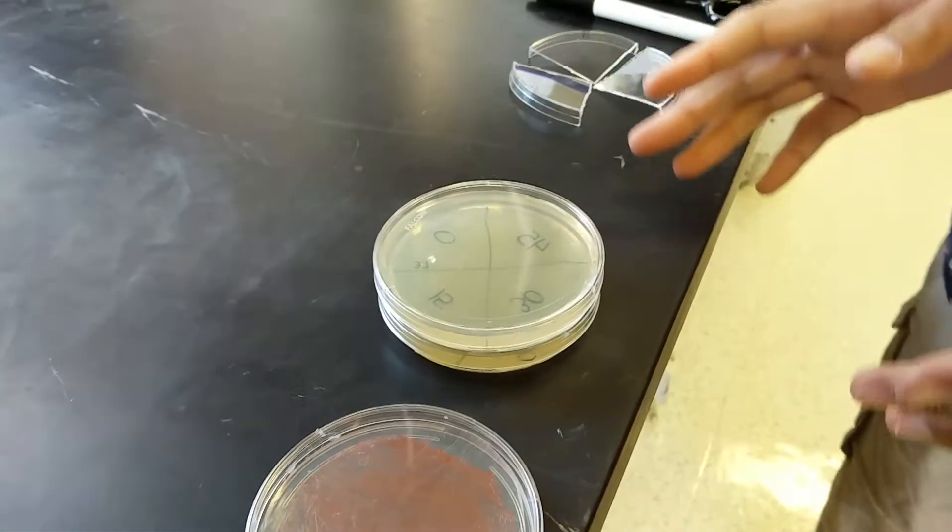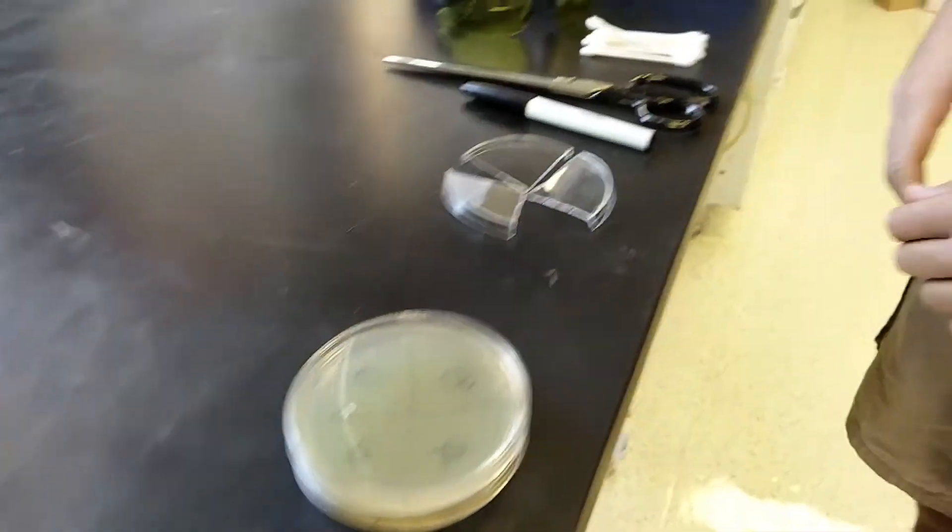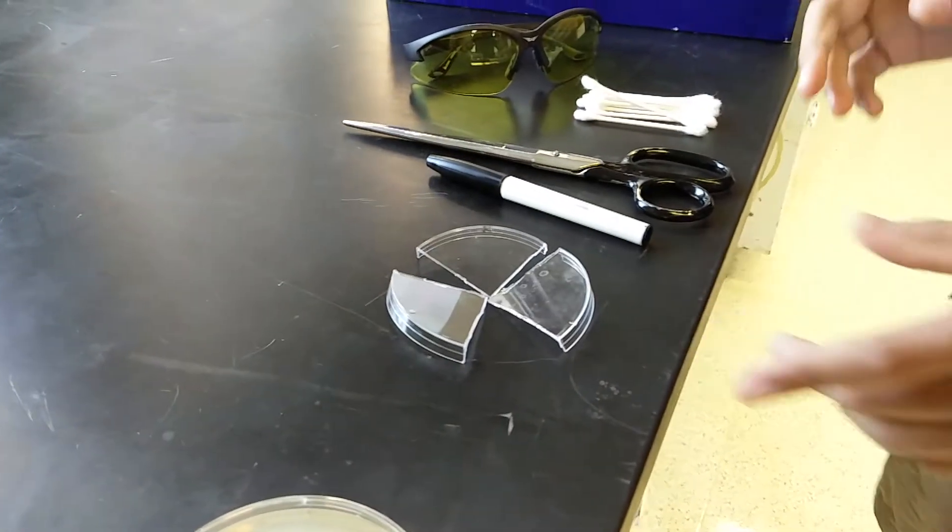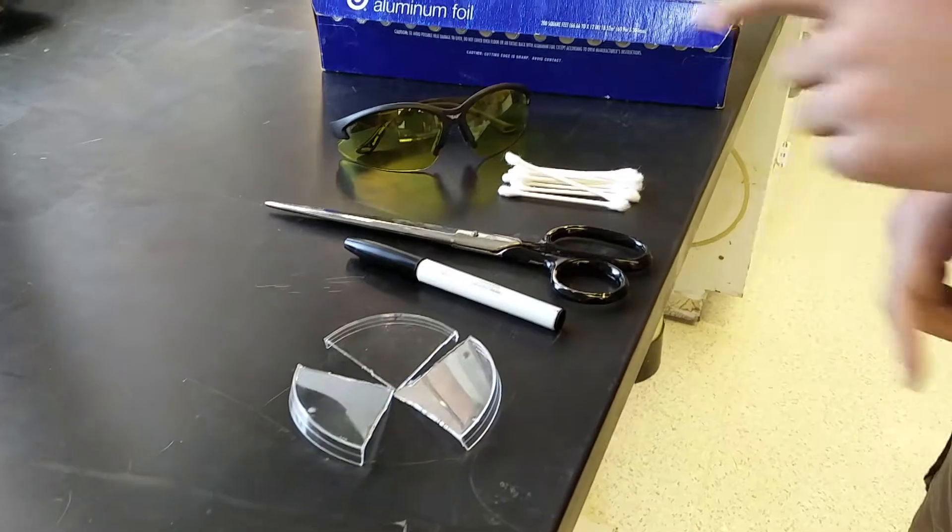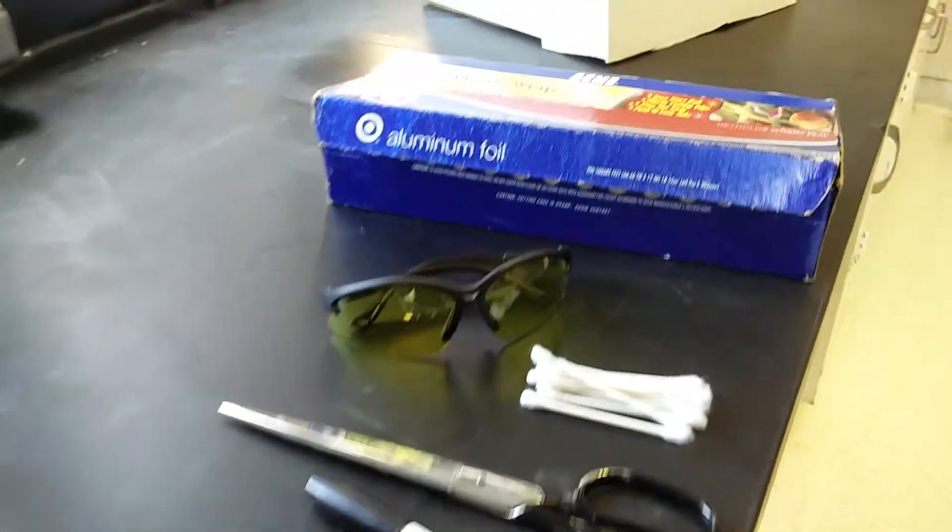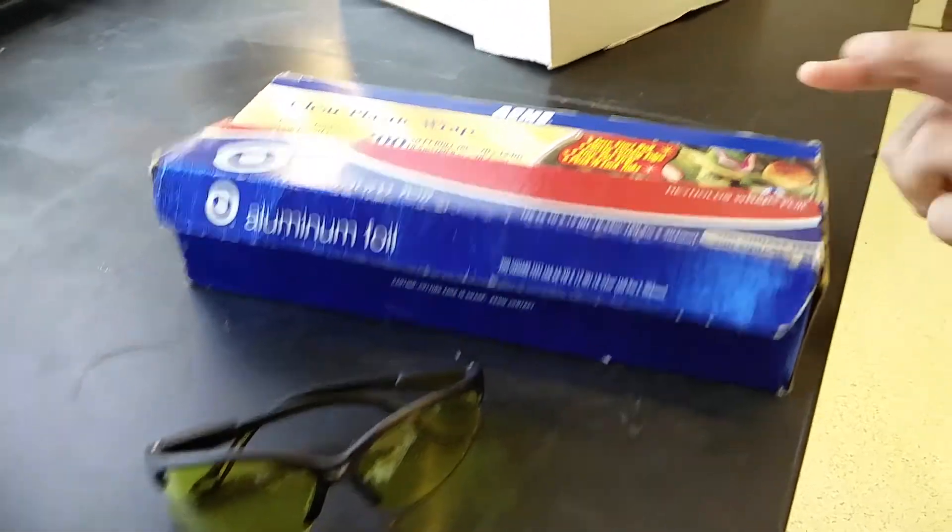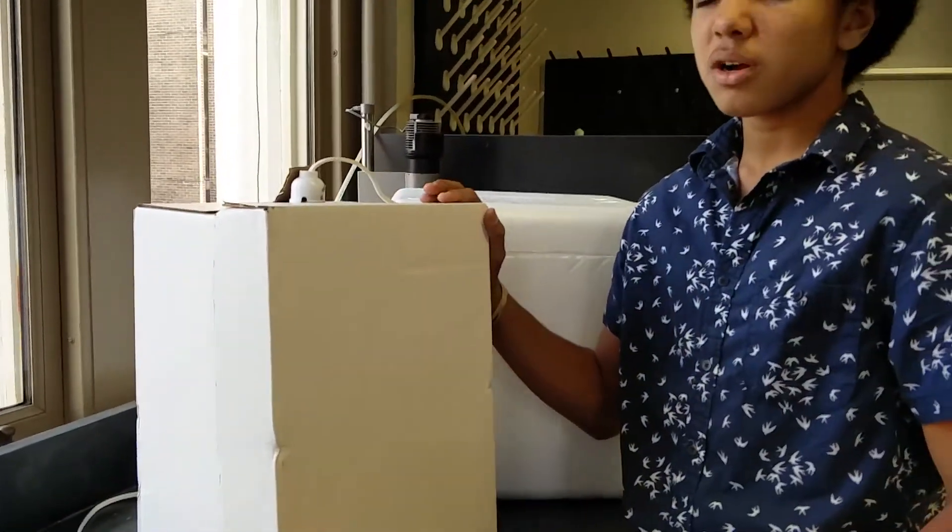Depending on the size of the class, a certain number of high salt agro plates, quarters of cut-up petri dish lids, a pen, scissors, q-tip, protective goggles, aluminum foil, and saran wrap. Most importantly you'll need the exposure box.